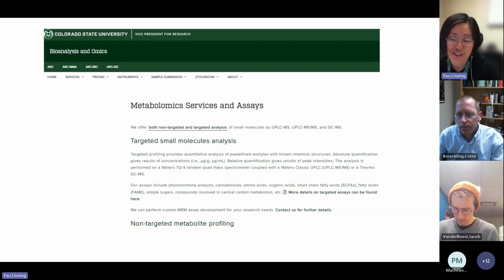Oh, that's a good question. For this case, I can't speak in general because each method is different. It seems like ammonium fluoride is working best for the 3 steroids that don't need extremely high sensitivity. And that additive is not hurting the estradiol after derivatization. So we can choose this buffer for all the analytes.